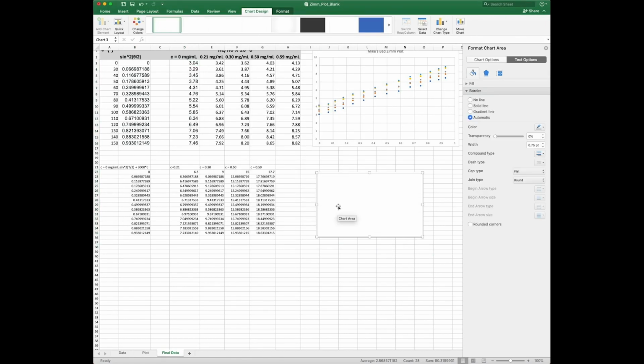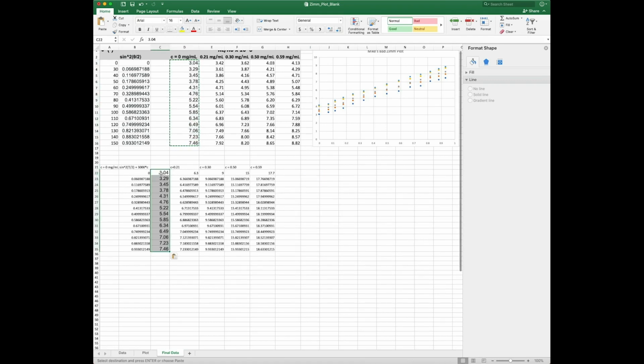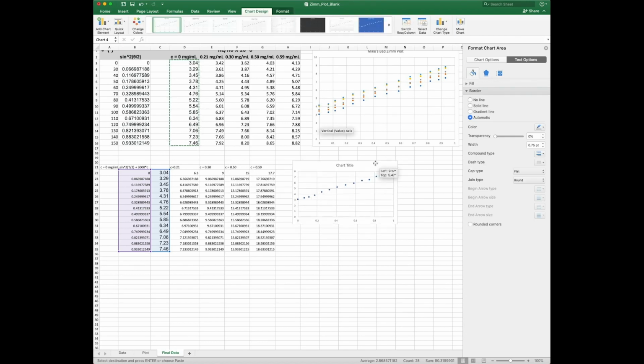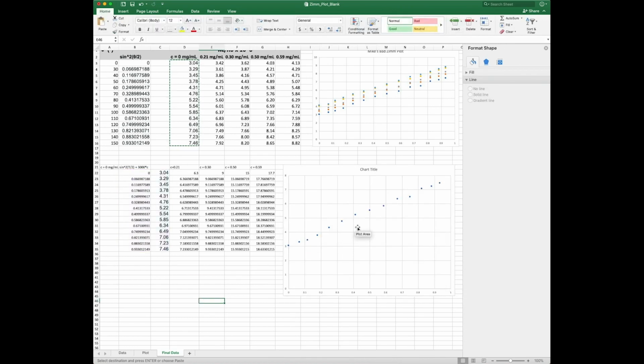I really screwed this up. This is why professional scientists don't use Excel. We use Origin or XMGrace or something like that. Okay, let me just get this started here. There's the X values and the Y values. Clearly, Microsoft Excel was not written for scientists. In fact, clearly Microsoft Office was not meant for scientists because it's so terrible.